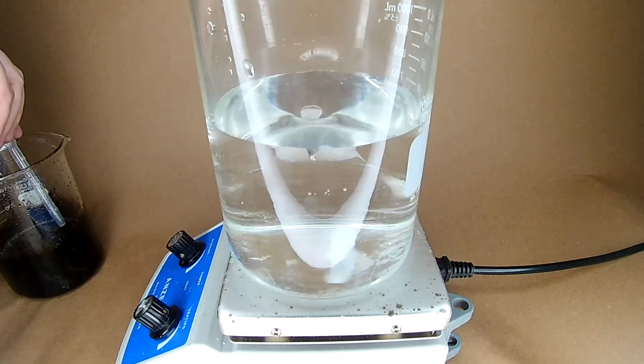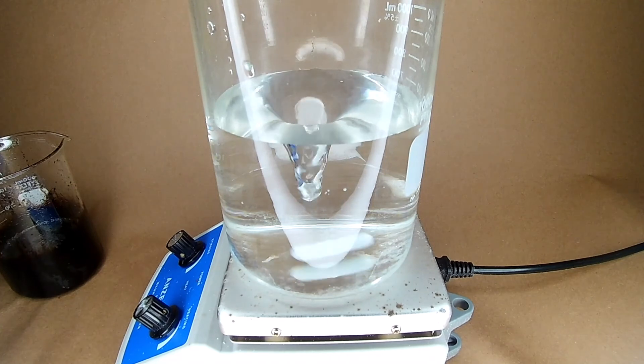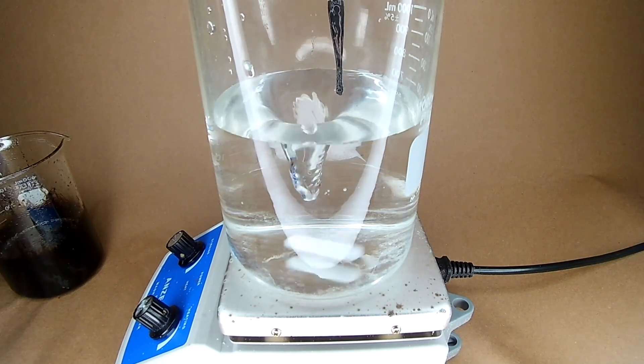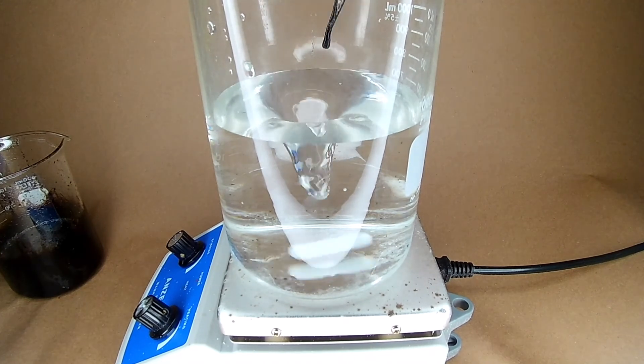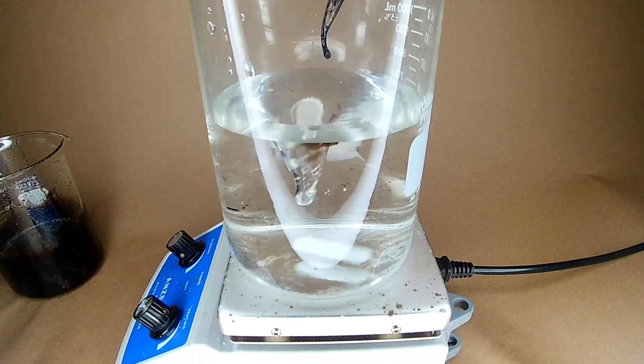So what happens when you put the solution in water, and the concentration goes below 64%? The solution was too hot for a plastic pipette to work. Swirling around, you can see tiny little fibers.